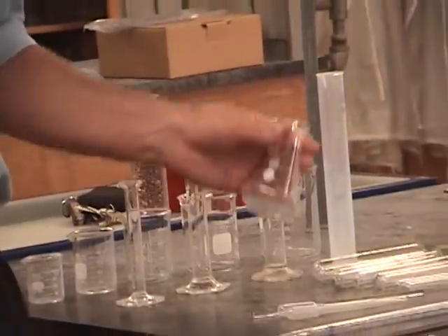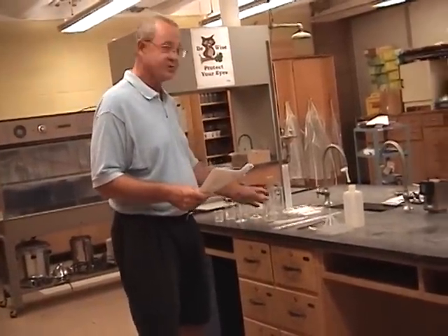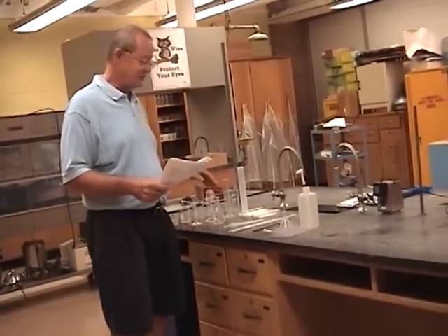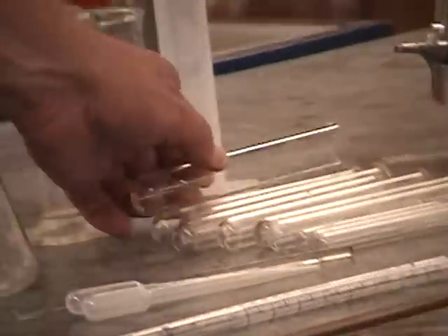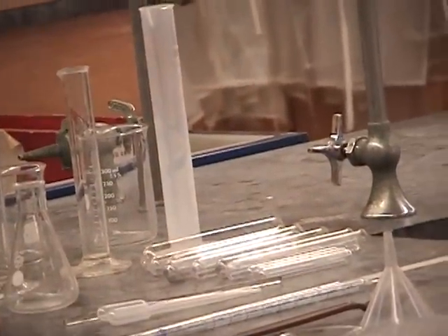Next, we have an Erlenmeyer flask, named after its inventor. His name was originally spelled E-H-R-L-E-N-M-E-Y-E-R, but it's now also acceptable to use the alternate spelling dropping the H. It's a 125 mL flask. We also have a series of test tubes — 10 total: one large, six medium-sized, and three mini test tubes.